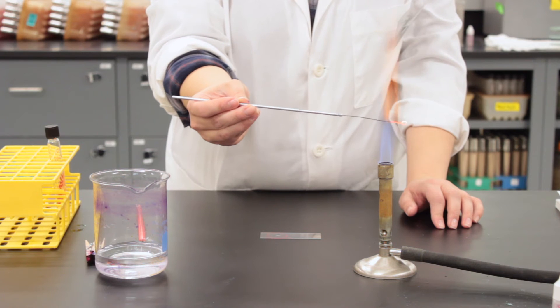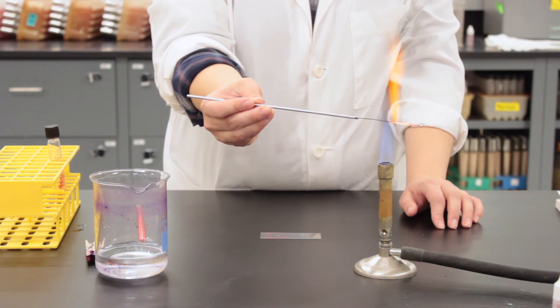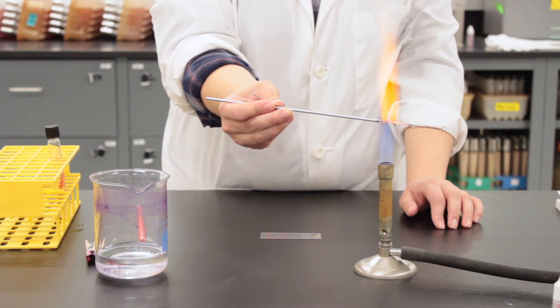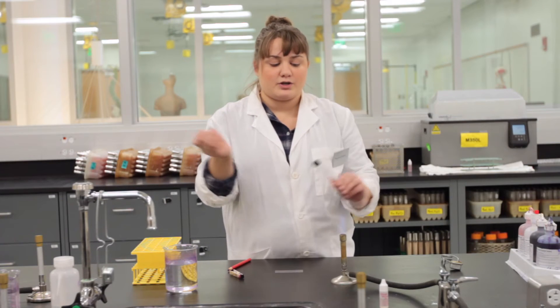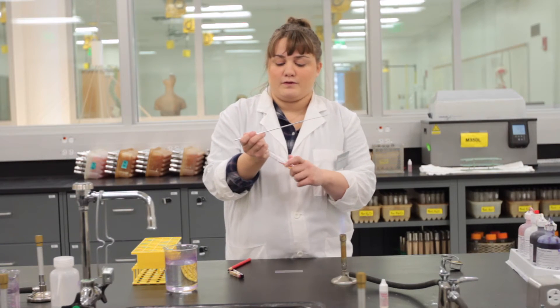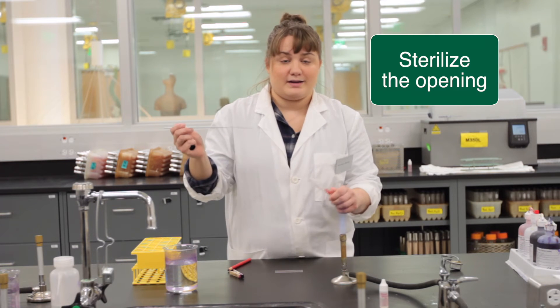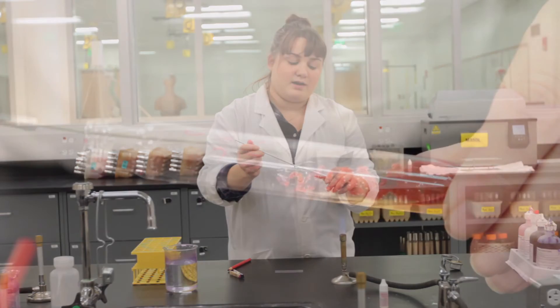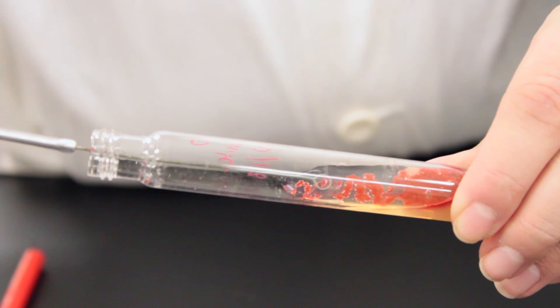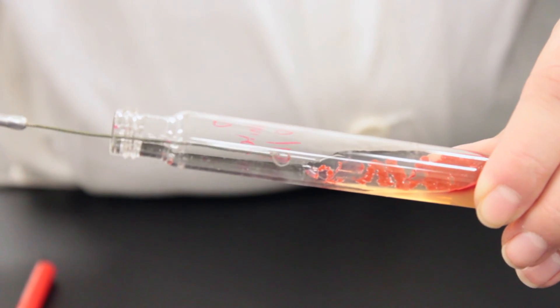Following that we will sterilize our loop again. Taking our bacterial culture, we will remove the top, send it through the flame, and then the inoculating loop will grab the bacteria.